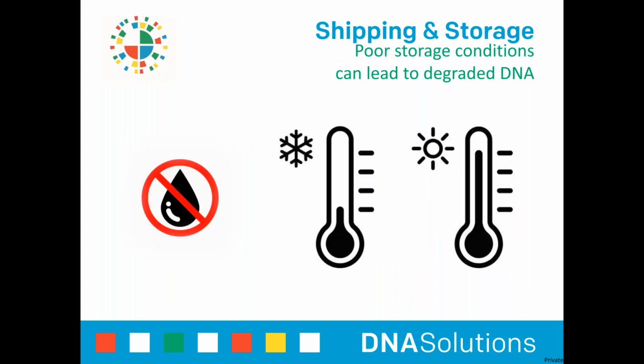In addition to shipping conditions, storage conditions can also affect whether a sample is viable for testing. Samples should be kept in a cool, dry area. Always avoid hot locations and keep samples out of direct sunlight. It is important for mobile collectors to avoid placing cases on their dashboards under the sun. Keep an empty cooler or a cool, dry storage box to hold collected samples to keep them as cool as possible while you are out collecting, especially if you have several cases to collect throughout the day.